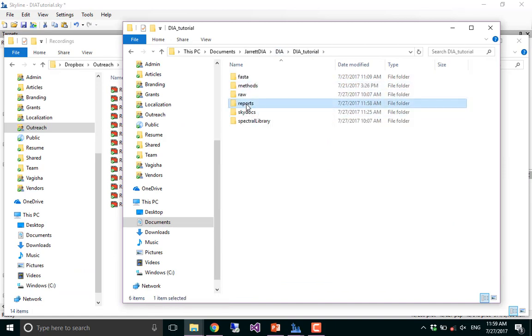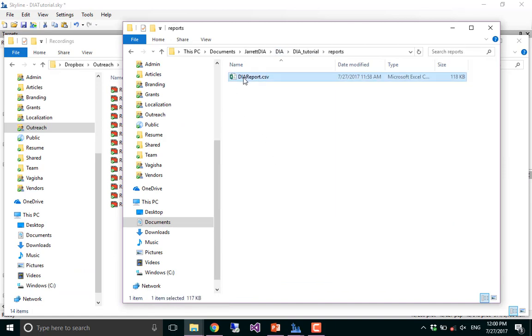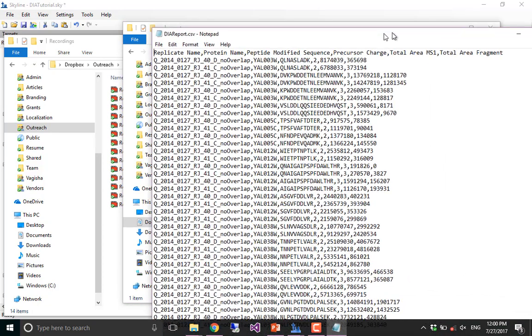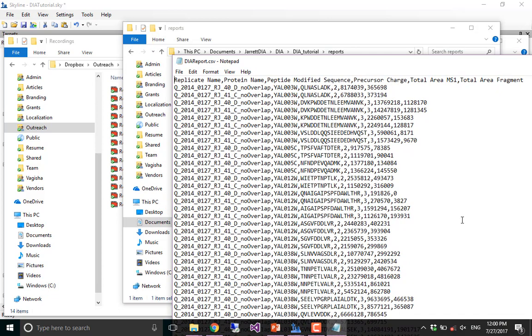If you open the file in something besides Excel, like Notepad, for example, it's just a standard flat text file. In R, it's a one-liner to import this file. Similarly in Python. If you're sending your data to anyone, generally they'll know what to do with CSV. It's a very interoperable format. Does that make sense? Is that what you were asking?